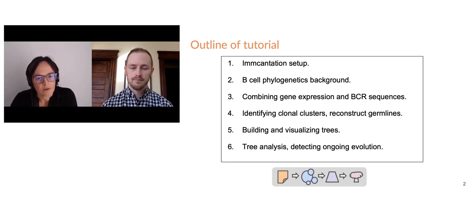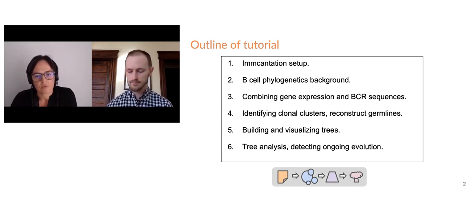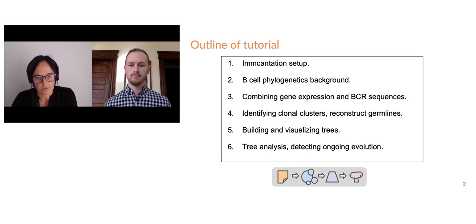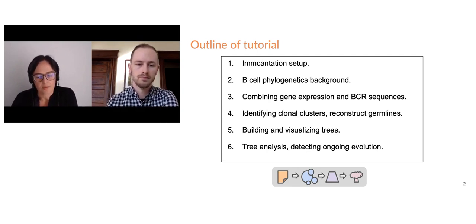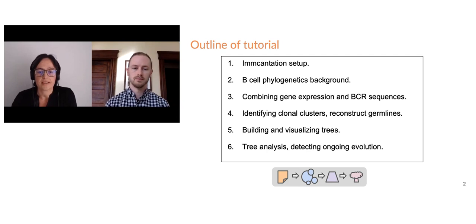This is an outline of everything we are going to cover. This session has been designed to be interactive, and during the first 10 minutes or so, I will introduce the Immcantation suite and will explain how to get ready to run the tutorial. If you can't follow along today, don't worry, because the code is available online and this session is being recorded, so you will be able to run the tutorial at your convenience.